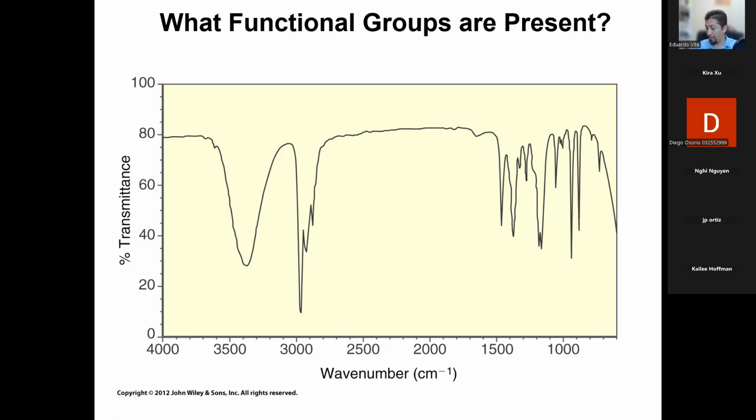And we're here to learn, so don't be scared of guessing. Nobody learns IR in 3 hours. It takes a lot of practice, and we're practicing right now. And this is the only IR lecture you get. So after this, you're on your own. So please, any questions you have, now's the time. What functional groups are present here?